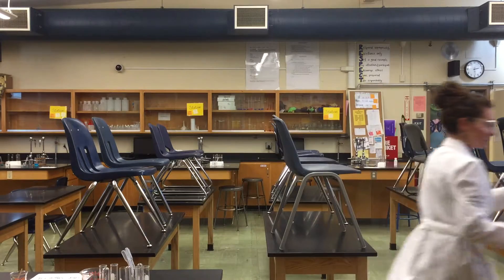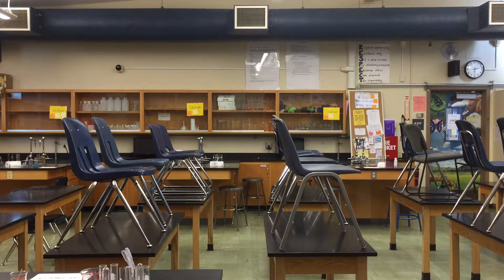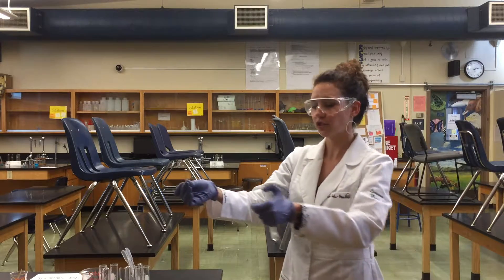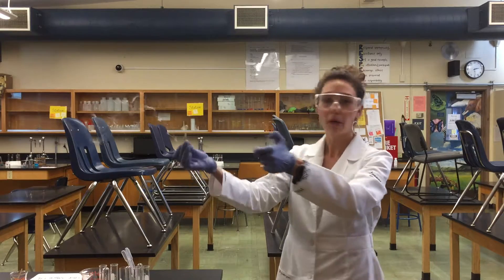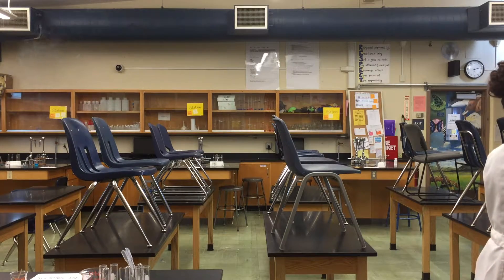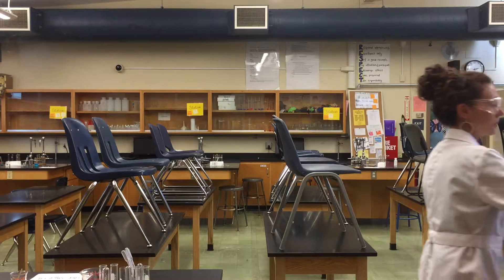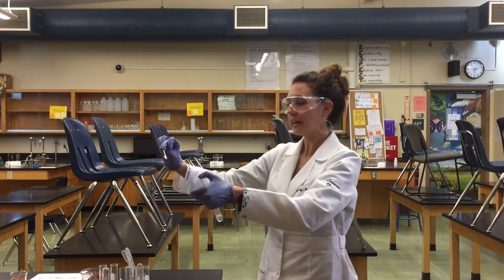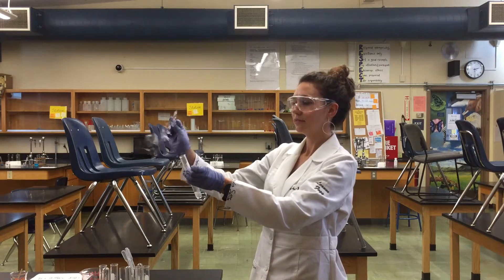I'm going to grab some matches. Here's a match. When I remove my thumb, I want to make sure it's lit. We should hear a nice little pop. Beautiful!